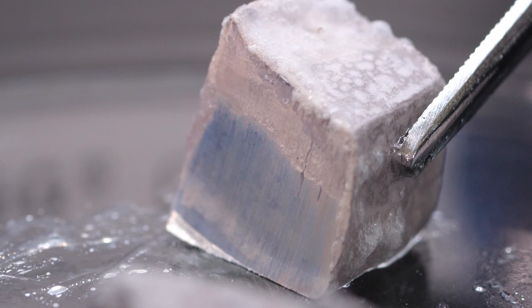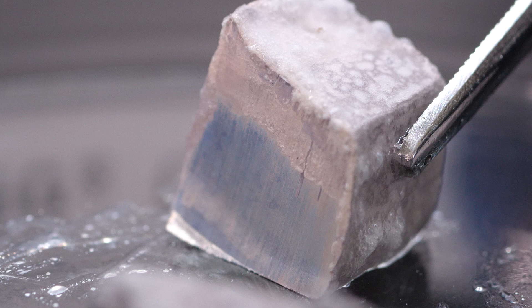Notice that the lump of sodium is shiny where we cut it. Most metals have a shiny luster, but when sodium is exposed to air, it reacts with oxygen, which produces a dull gray coating of sodium oxide.